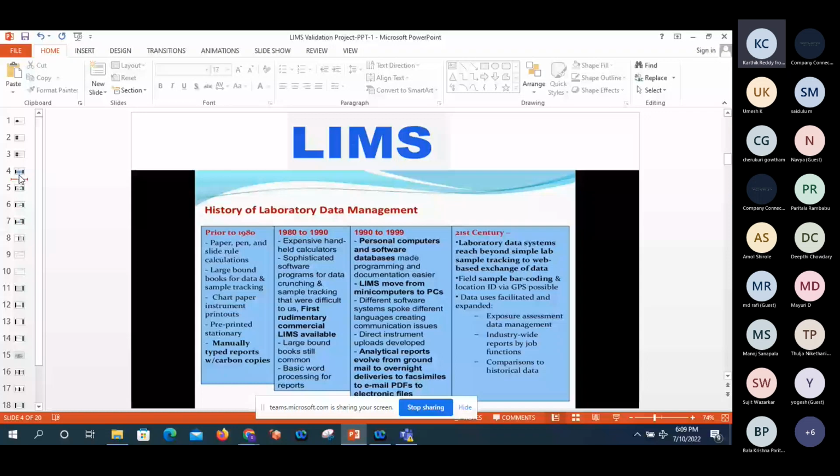So in the 21st century, over the last 25 years, there is a huge demand coming from the regulatory industries, like the FDA, Food and Drug Administration, Health Canada, MHRA, Medical Health Regulatory Agencies, TGA, whatever is available in the current regulatory industries. They are asking that it should not be paper based. Why? Because there is manipulation. So many things people can do.